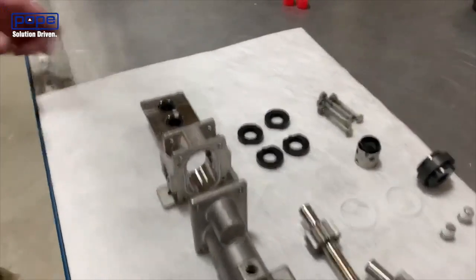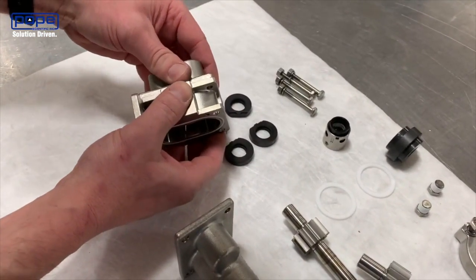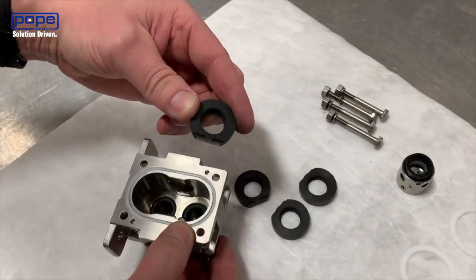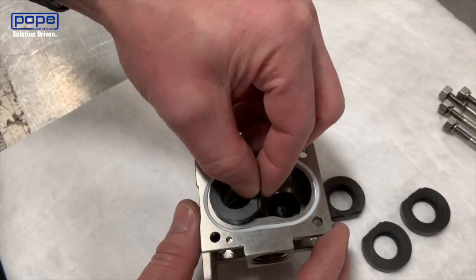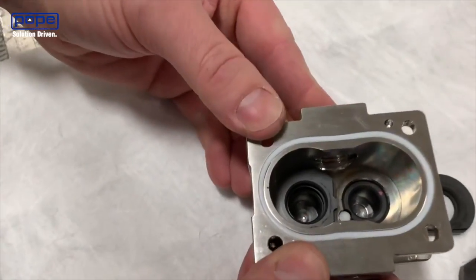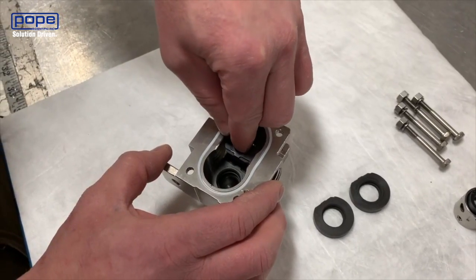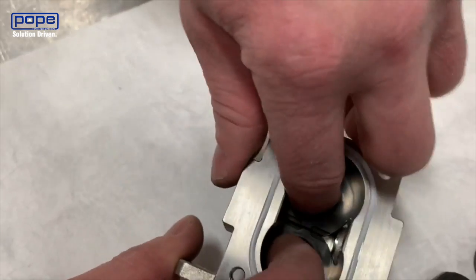Now we're putting the pump back together. The first thing you're going to do is line up the rear housing and the center housing — those two pins will hold it in place and make sure it fits exactly where it needs to go. Now you're going to add in the carbon wear plate. There are two relief grooves on that carbon wear plate, and you'll want to pay special attention to how we're lining those up. Insert it so that the relief grooves are facing towards the center, and put in the other carbon wear plate with those two relief grooves facing each other.